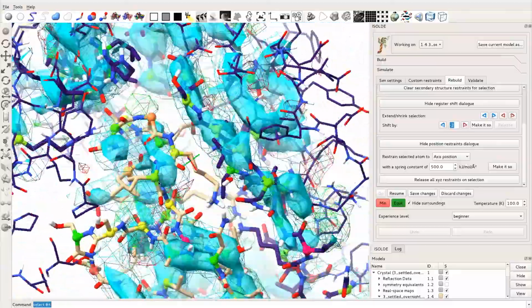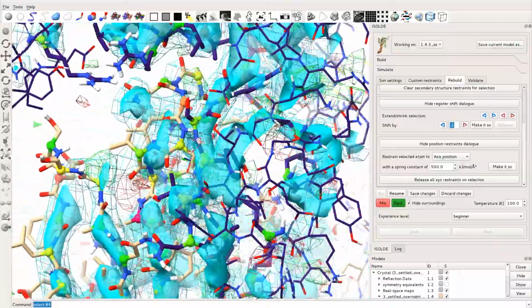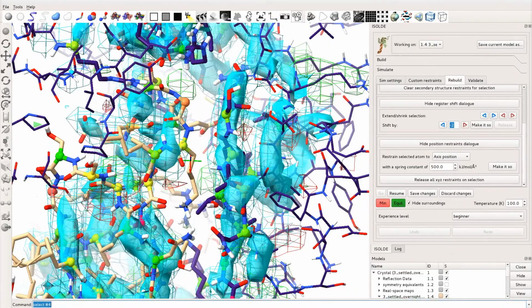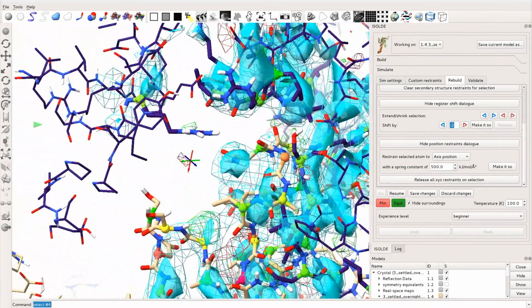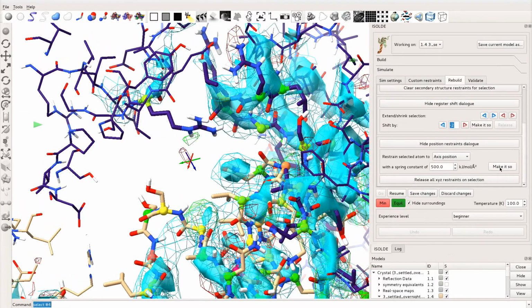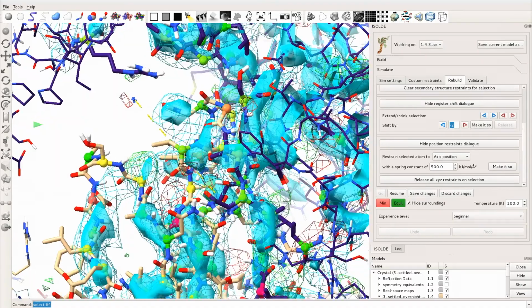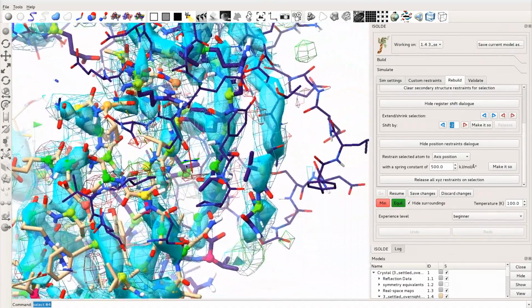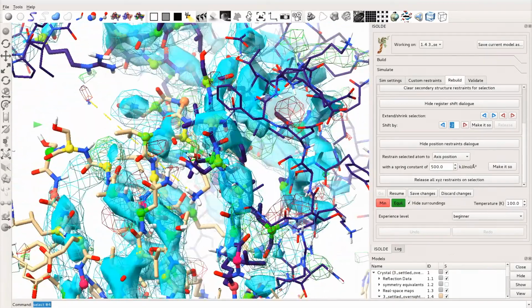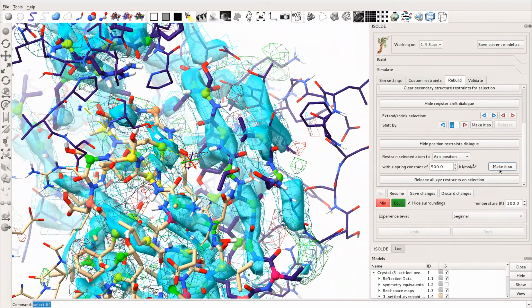Up here at the C-terminal end of the problem stretch is a smaller but also quite classic problem often seen at this resolution, a dipeptide flip, where 2 consecutive side chains are each pointing 180 degrees away from their true orientation. This is also easily fixed with a couple of temporary position restraints. With the simulation paused, select one atom from each side chain and add a restraint approximating its new position. Then start the simulation and clear the restraints once the flip is complete.